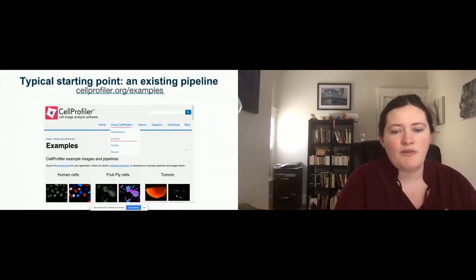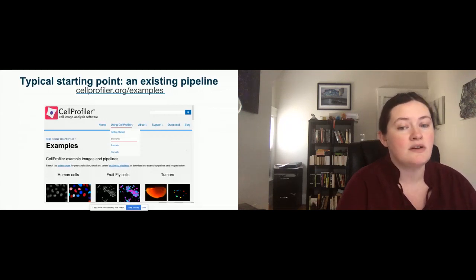And so we provide a number of examples on our website because our goal here is that we don't want you to actually have to figure out how to do this by hand. There are a lot of different kinds of biological images you might be interested in looking at. And we want to help you get started by giving you some examples that you can start from so that you can change the pipeline to fit yours.